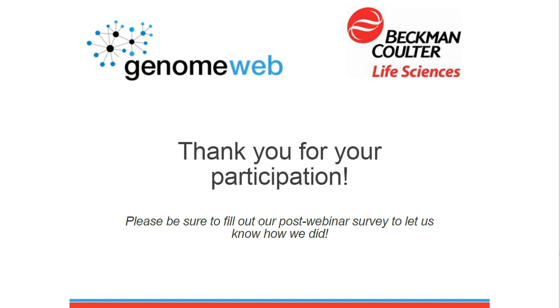Really observed this. Maybe Aset can also answer this question. There are always things that you can improve. The Echo does so much already, and it's far better than what you can do by hand. What you have to take into consideration, for example, is that there is a dead volume.